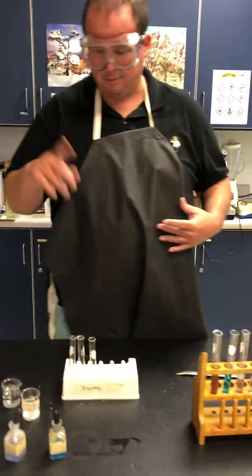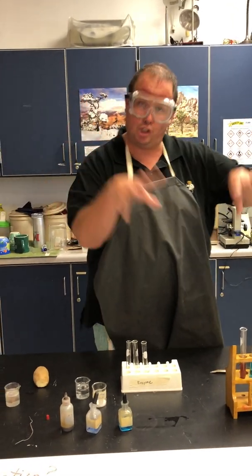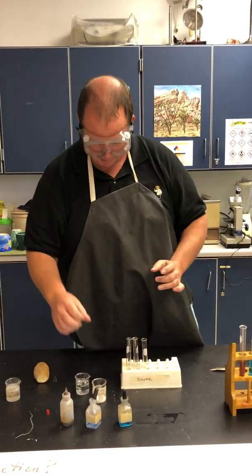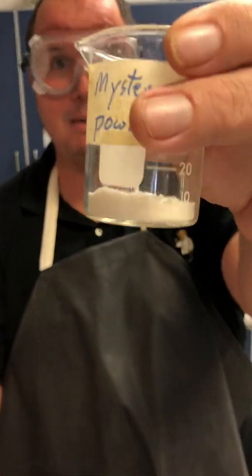Good question, Miss Murdoch. Now, ladies and germs, we are going to do a chemical indication. You should have watched the lab before this presentation by Miss Murdoch. So now we have our mystery powder. Oh, what is in this powder?